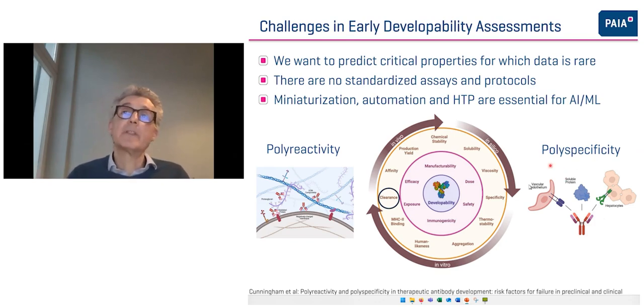And polyspecificity is something completely different. It is the potentially strong binding of a molecule to a non-related target. So that is rather something impacting the safety of a molecule.